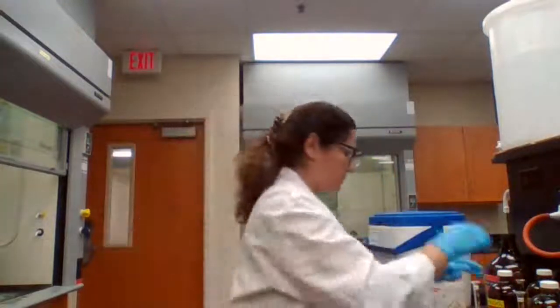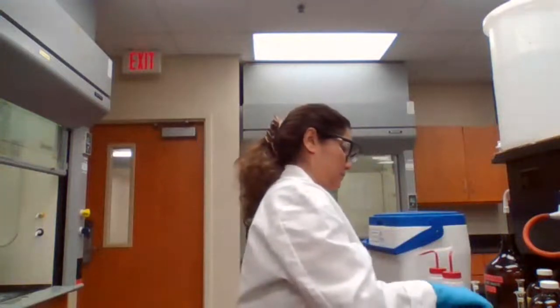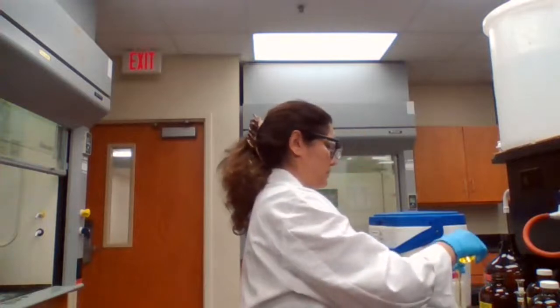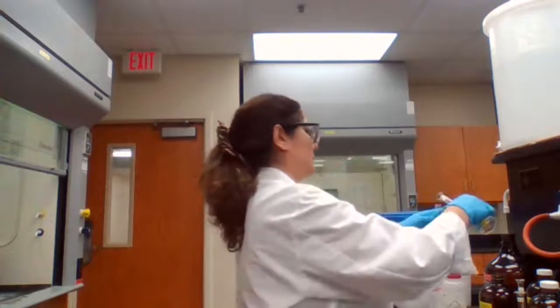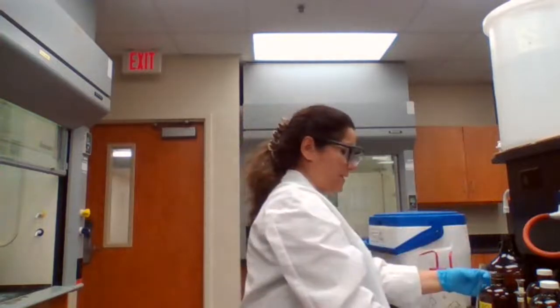I have my goggles on, have to make sure. We're adding 1 milliliter of potassium chromate.